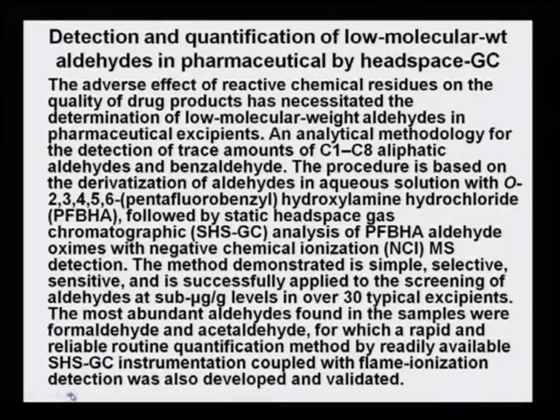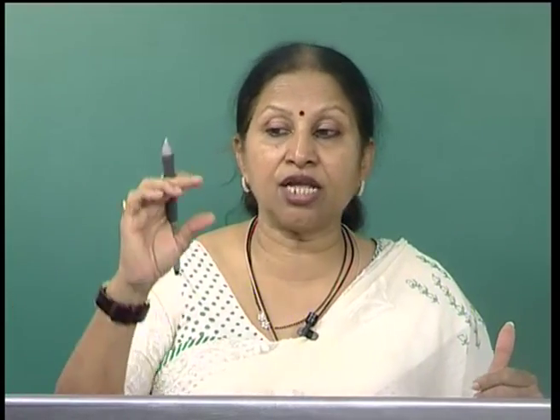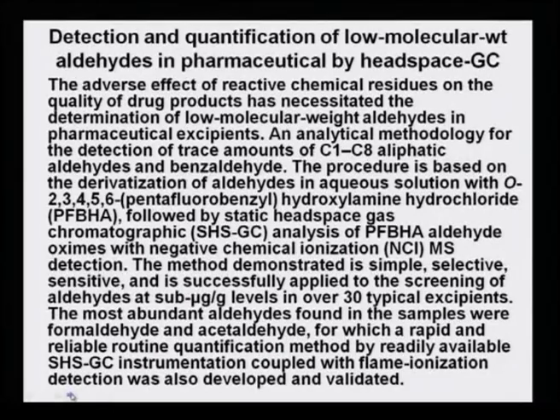Now, you see, we have gone into a little specified technique because these aldehydes are low boiling, and also they do not give a molecular ion peak at the required time and at the required length. It is important to find a new method to analyze these very specific aldehydes.